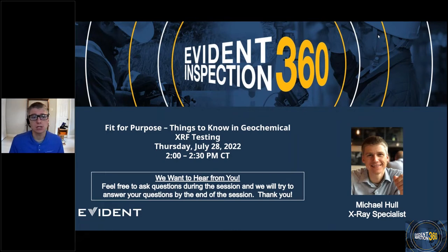We're going to talk about things to know in geochemical XRF testing. When you're using XRF to do geochemistry, what are best practices? What are pitfalls to avoid? So it should be a good session, and I appreciate you all joining this afternoon.